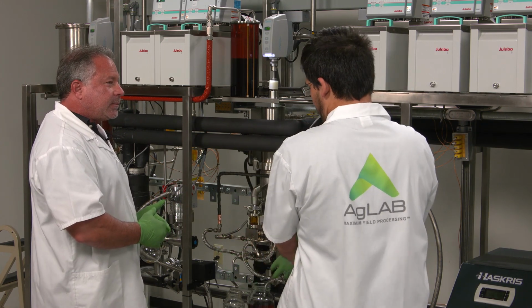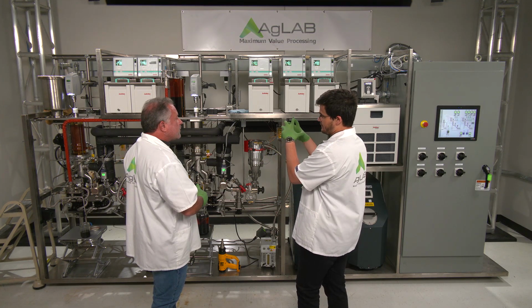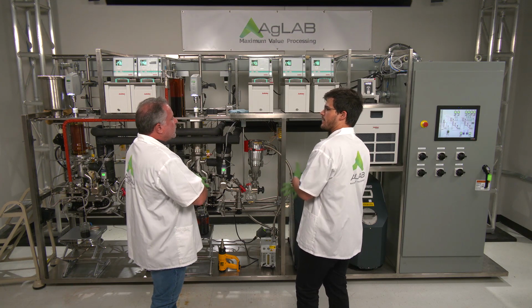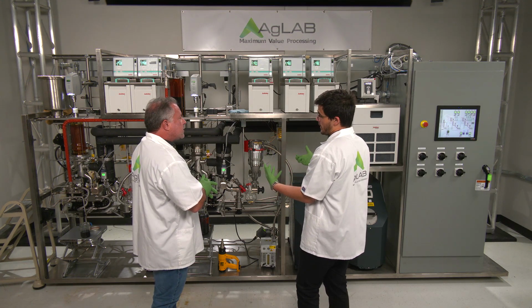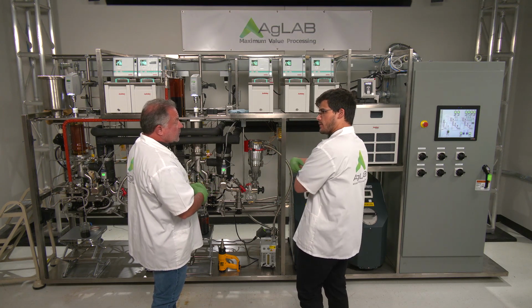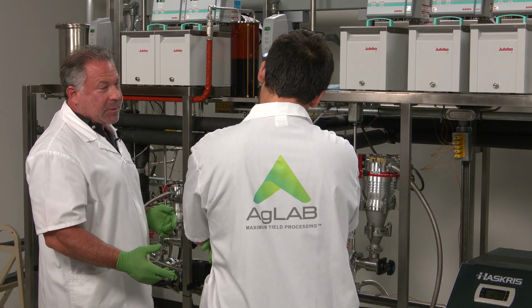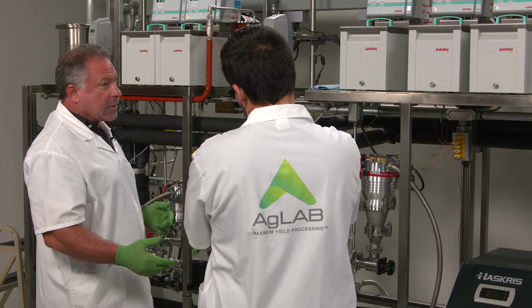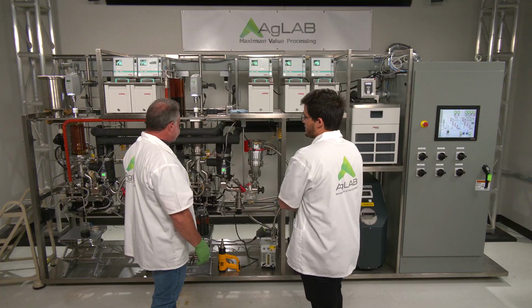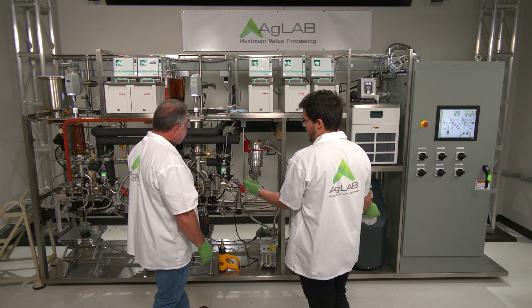So if we were going too cold on the condenser and CBD was condensing on there, but it wasn't really able to flow down as well, would you expect a darker color? Does the temperature of the condenser also play a role with viscosity in mind, so it can flow nicely? Viscosity is important there. Also, what else are you condensing? If you're going to a lower temperature, you can condense other types of molecules. Yeah, you're still going to have some isomers, some terpenes that didn't get taken out, maybe even, who knows, some water, depending on if your vacuum's holding up all right.